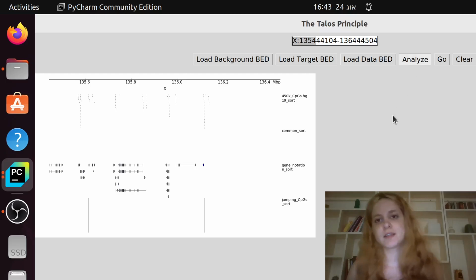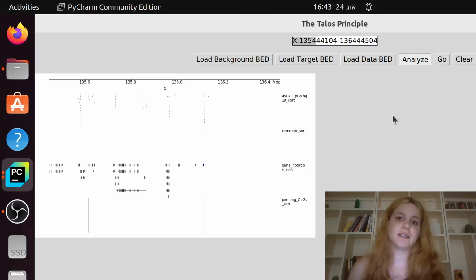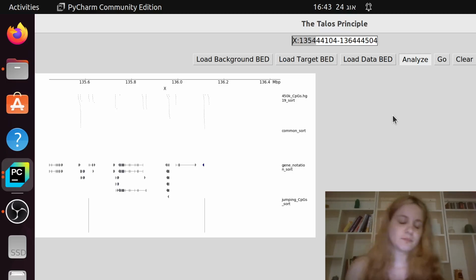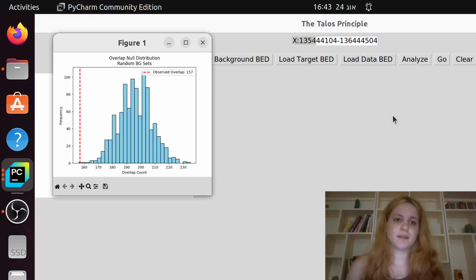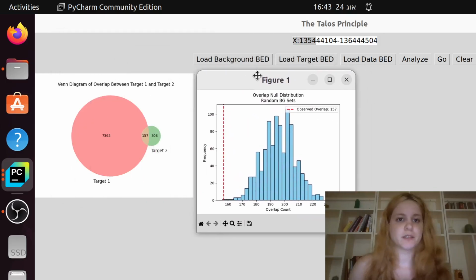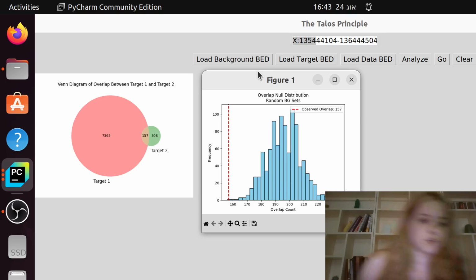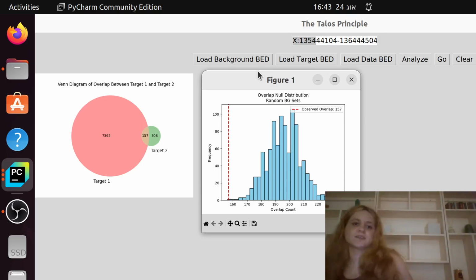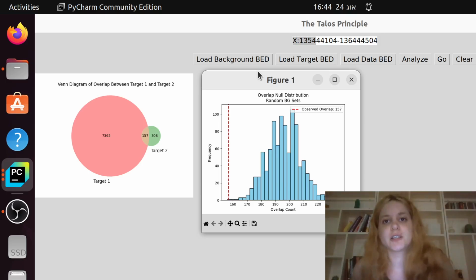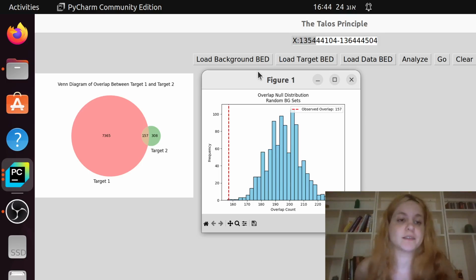Again, it's going to take time. It's a Python program, I'm sorry. What it's doing in the background is basically to take the... okay, it's a bit complicated, but maybe I will leave it to another day because we also have the results in here. Also, you can see what the program does if you go and check the script. I recommend it if you are interested.